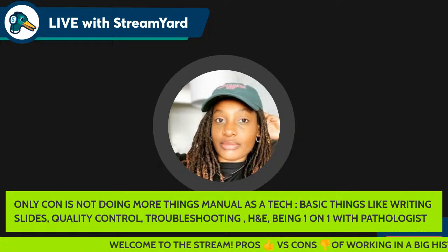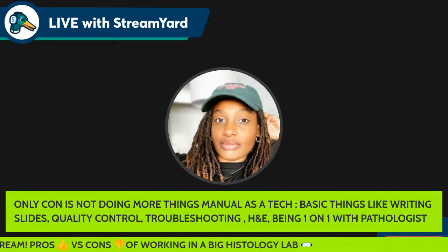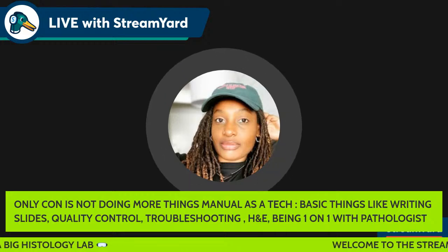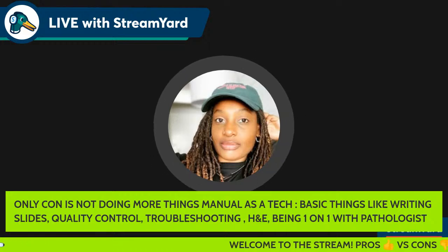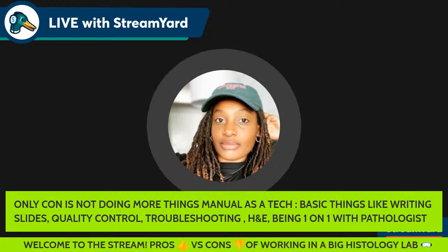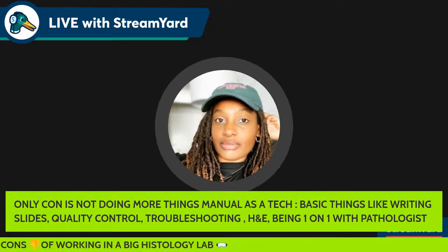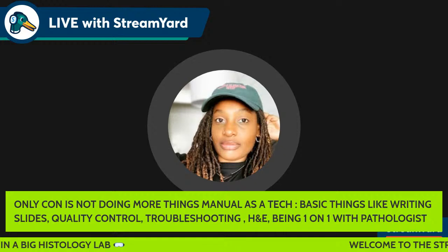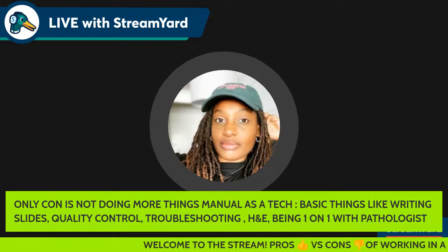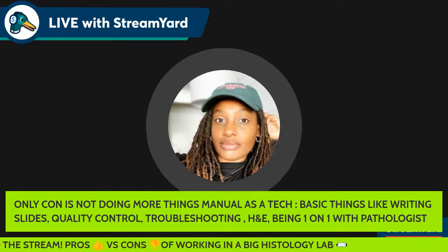The next thing is basic things like writing slides. That's another manual thing that is a con. By working in a big lab, I used to write the slide with a pencil. And the funny thing is, as I'm talking to you guys now, I work in an automated lab, but because I'm in neuropath, things are done manually. So it's a whole separate process from general histology. So whenever my labels are not printed for my slides that I've created, then I manually write those slides, or I may have to manually make a cassette and write the cassette in pencil.